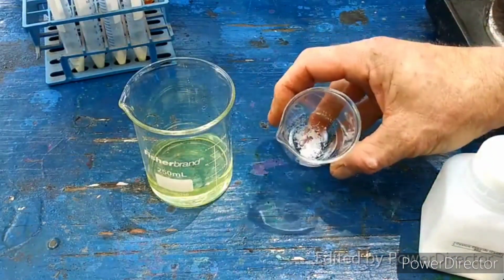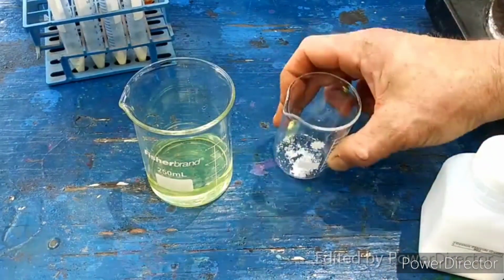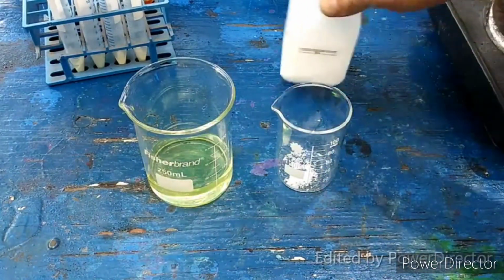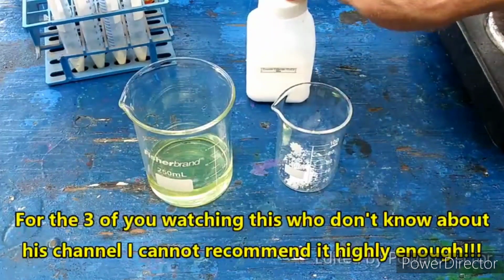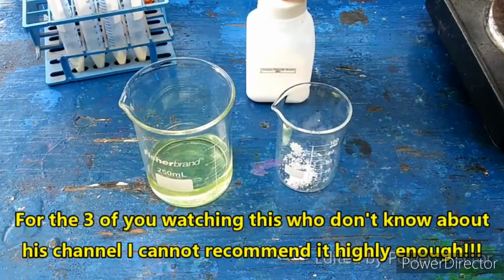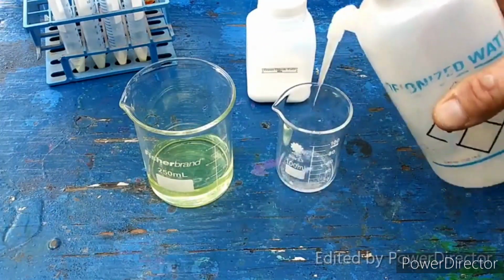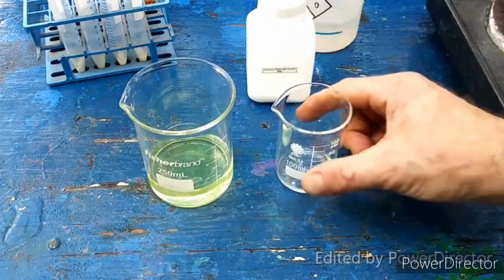Alright, so here we've got 0.93 grams of cesium chloride that was donated to the channel by Backyard Science 2000. Much thanks, my dude. I really appreciate that, man. Alright, so what we're going to do now is dissolve this in a small amount of water.